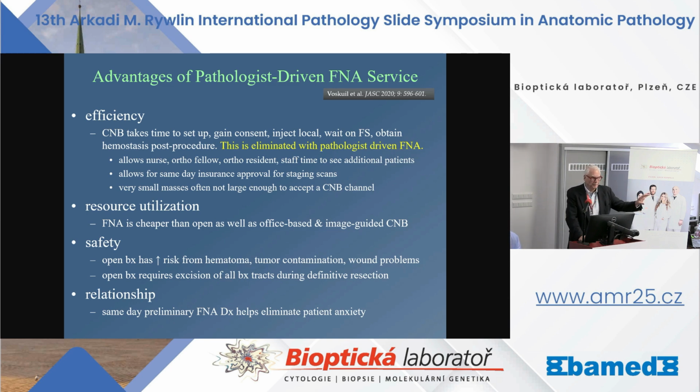I do 50% of the smears stained by DiffQuik. We do the Pap stain the next day. After I look at the DiffQuik stained smears, I tell Dr. Marison, "Oh, this looks like a spindle cell sarcoma." I don't make a definitive diagnosis of spindle cell sarcoma. "Joel, this looks like a spindle cell sarcoma."